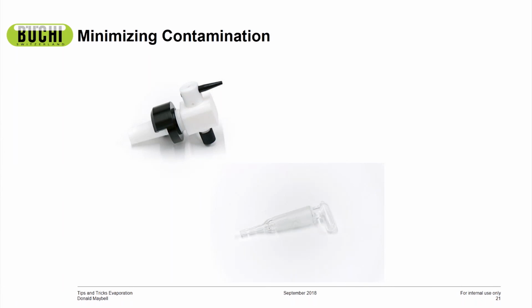the top. What this does is it eliminates grease because you don't need grease at all. There's just a little valve there and there's no contamination. So it just makes things extremely easy, and it keeps your product nice and clean so that when you do collect it or go to analyze it, you don't have to worry about grease appearing in your results.